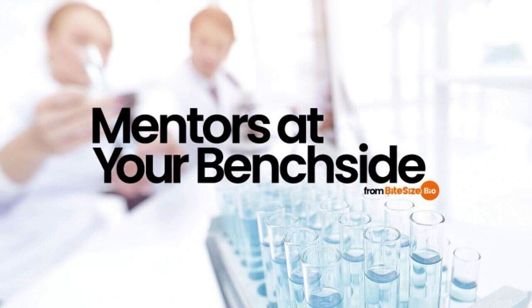Thirdly, set the primer pair specificity checking parameters. Use the default settings for these. The program will use the RefSeq mRNA sequence from the organism you selected to design the primers. Next, checking the output screen. Once all the parameters are set, clicking on Get Primers returns a list of potential forward and reverse primer sequences to choose from. This can take a while, but the screen updates periodically to show you the time since submission.